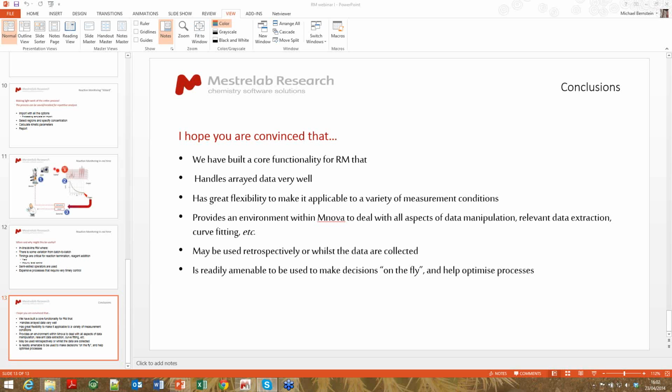And lastly, Gamage has asked, if the reaction has started when you take the first spectrum in the array, then the initial concentration is not the calculated concentration, correct? This may be okay for the large concentration, but not the smaller. What do you think? Well, you're quite correct, Gamage. Using the first spectrum there would not give you the initial concentration, and then you'd have to rely on one of the other ways in which to determine the concentration.